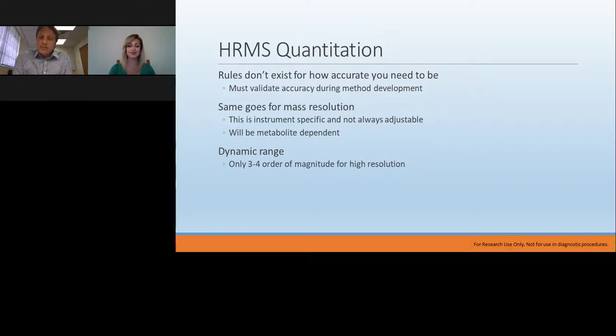Well, in our case, using high resolution was a key part to help understand the future of what we want to measure. One of our goals is to be able to use a single platform to do many different kinds of measurement, rather than having to expand a new instrument every time we need to do a different measurement. So in this case, using high resolution enabled us to separate out, at least in the ones I showed, metabolites of interest using only high resolution and mass accuracy, and get similar performance that you might get with a triple quad, as well as being able to improve the identification of other species within the sample, within the set that you may not have thought about measuring or may not know about measuring.